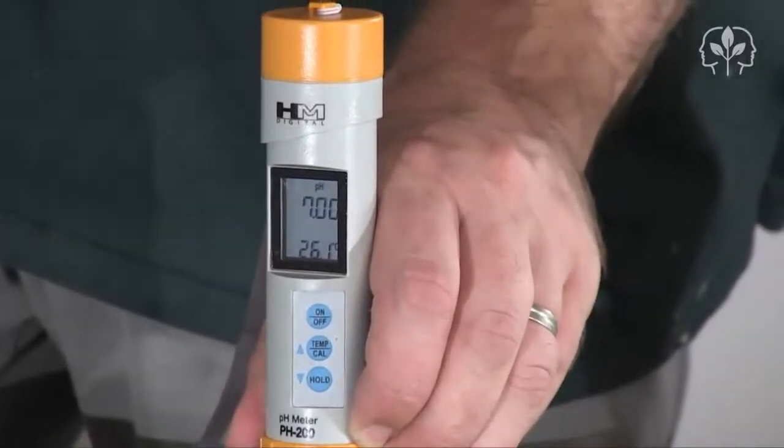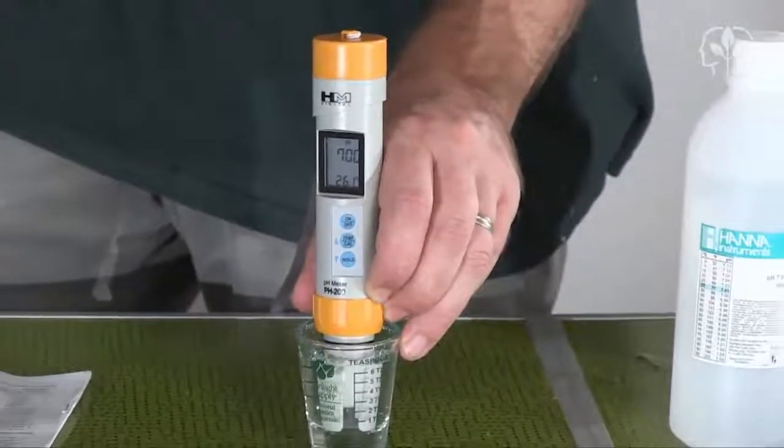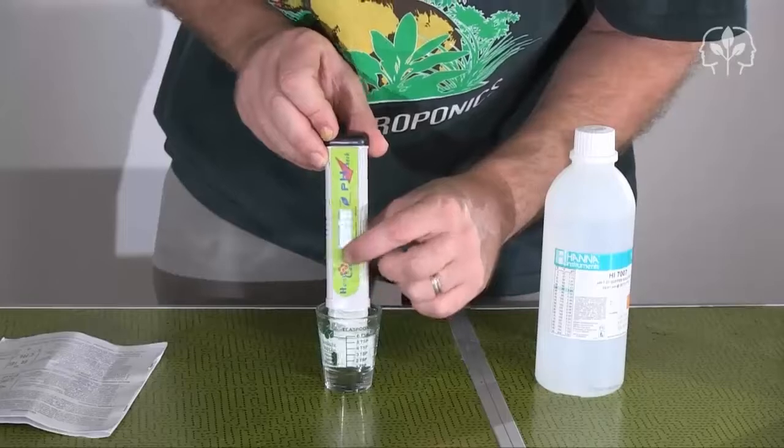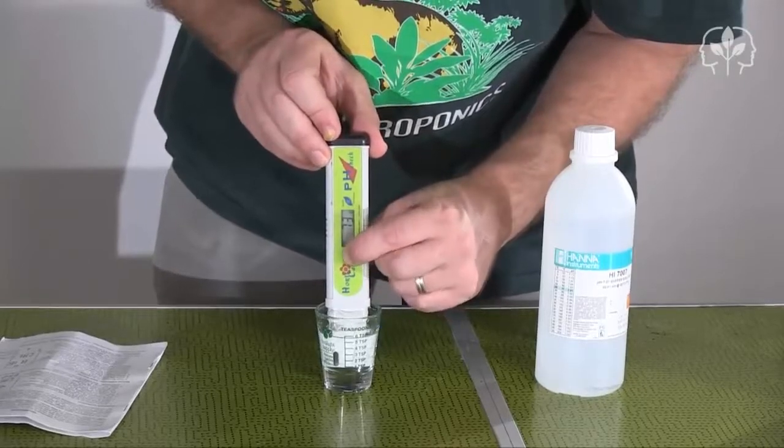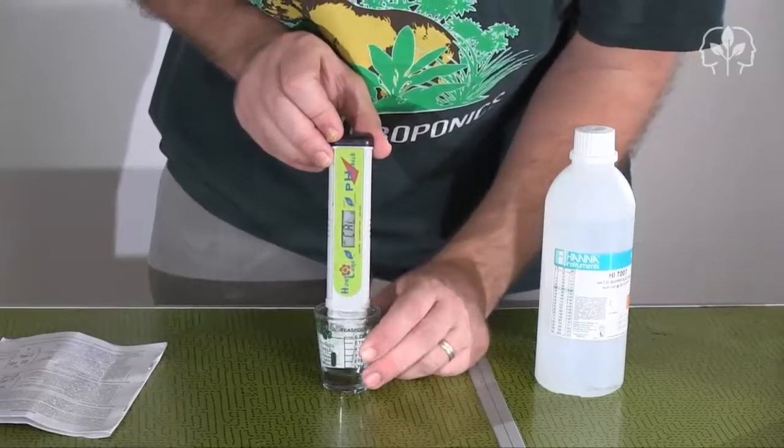The HordiCare meter is easy to calibrate too — just dip it into the calibration solution and hold down the Cal button. Pretty much the same process. So my newly calibrated pH meters reveal one important thing.